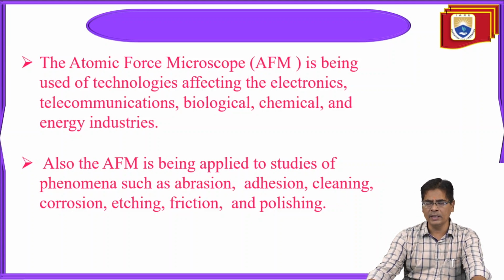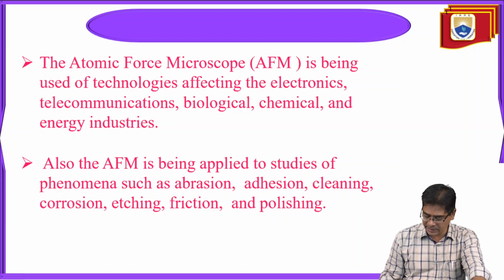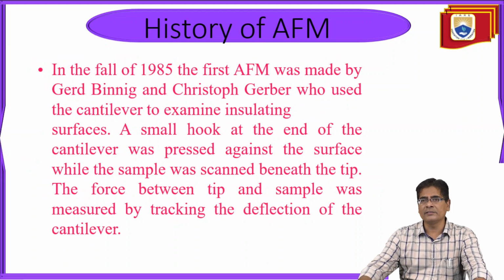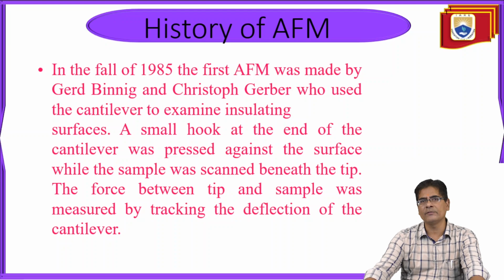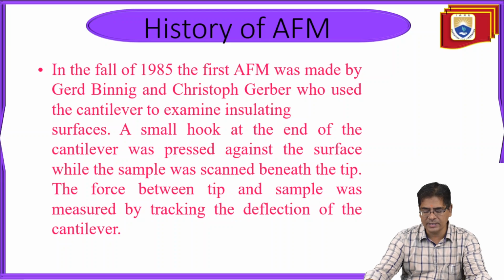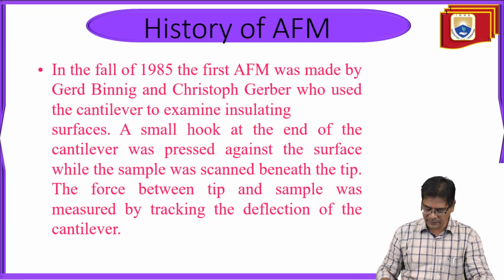That is why atomic force microscopy is used in technologies affecting the electronics, telecommunications, biological, chemical and energy industries. If you see some of the history of the AFM, in the fall of 1985, the first AFM was made by Gerd Binnig and Christoph Gerber, who used a cantilever to examine insulating surfaces. A small hook at the end of the cantilever was pressed against the surface while the sample was scanned beneath the tip. The force between tip and sample was measured by tracking the deflection of the cantilever.